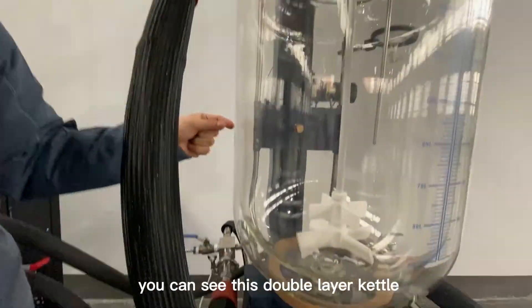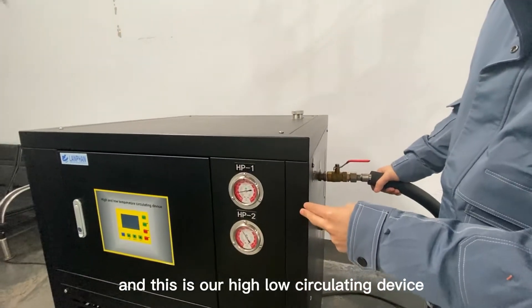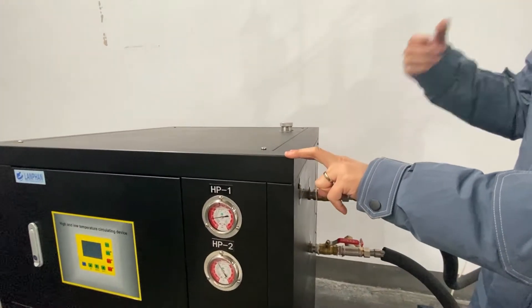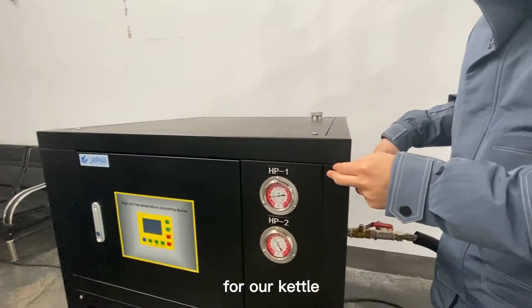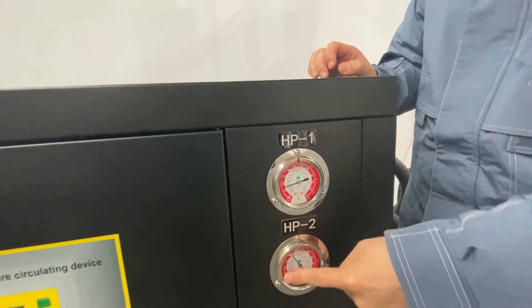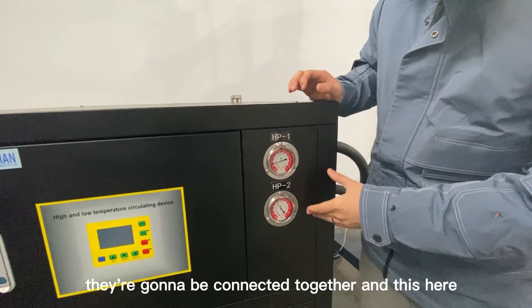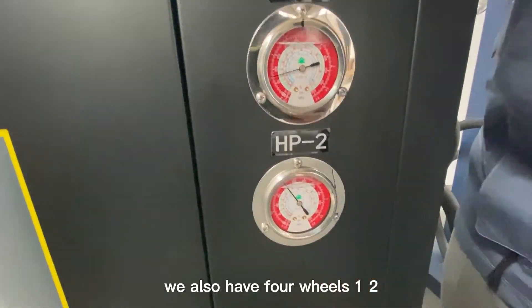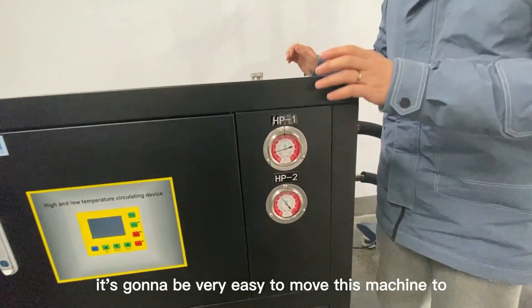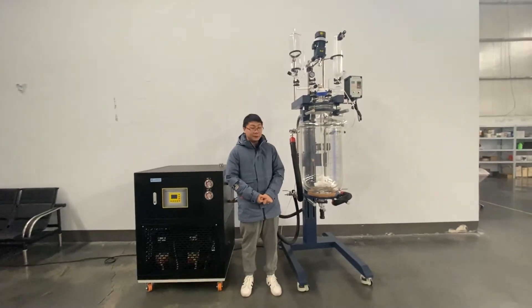You can see this is a double layer kettle. Over here is our high-low temperature circulating device, which is going to provide high and low temperature for our kettle. This is the control panel — we have two gauges here. These two machines are going to be connected together. This unit also has four wheels — one, two, three, four — making it very easy to move to another place.